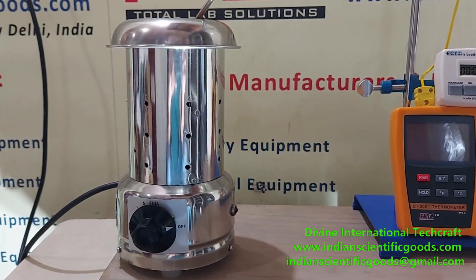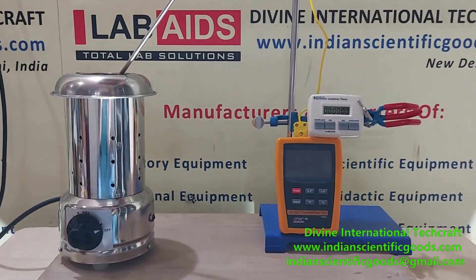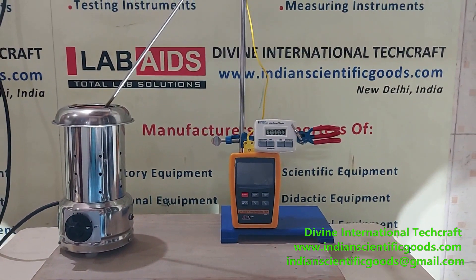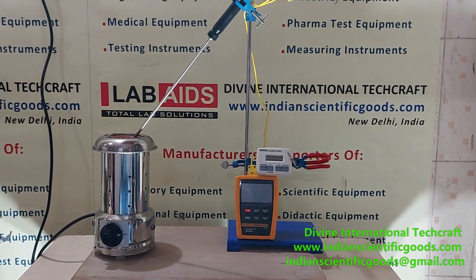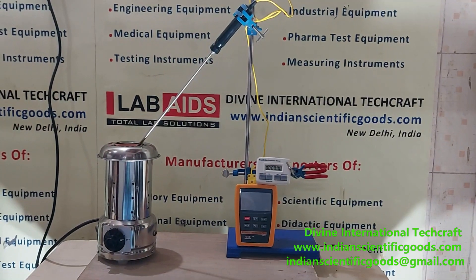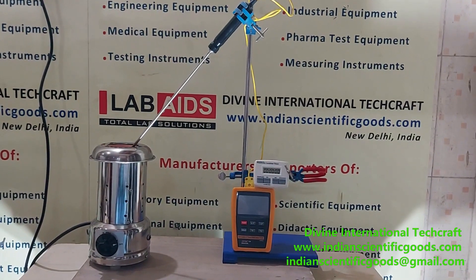Hello, this is a flameless electric Bunsen burner manufactured by Divine International Techcraft, New Delhi, India. Today we will see the performance and efficiency of this flameless electric Bunsen burner. We will see what is the maximum temperature that is attained by this burner and in how much time.